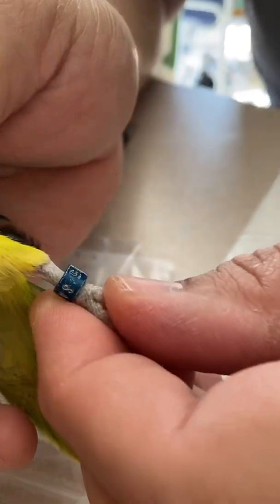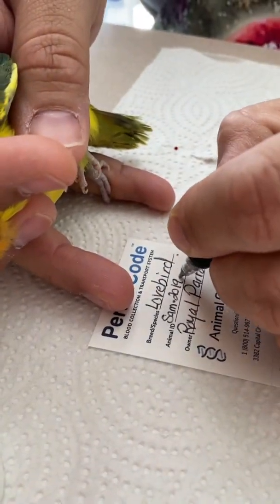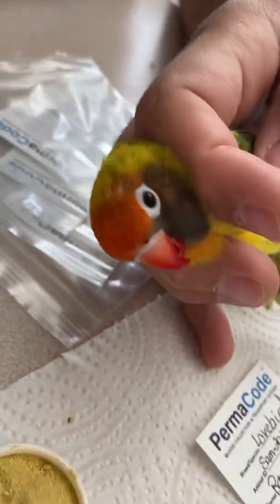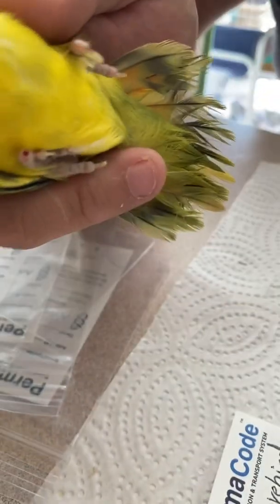If you look closely, Dennis is looking at the band number. The band number will give you the label ID to write on the DNA card itself. You can see him writing in the letters and the numbers that he saw on the band. Usually the letters and numbers indicate the year the baby was hatched, the initials of the breeder, and the number bird that breeder hatched for that year.